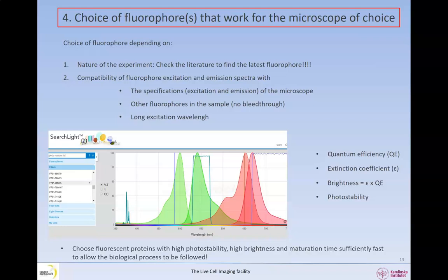It is not very likely that you will always have these characteristics at their best in one fluorophore, but knowing what they are, you will be able to compare several fluorescent molecules and pick the best for your particular experiment.